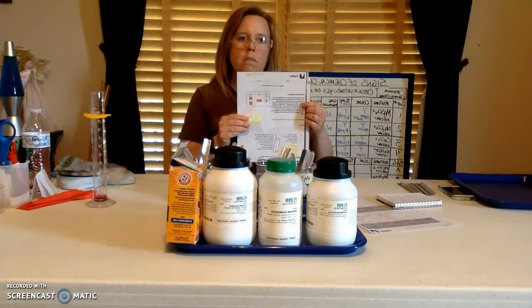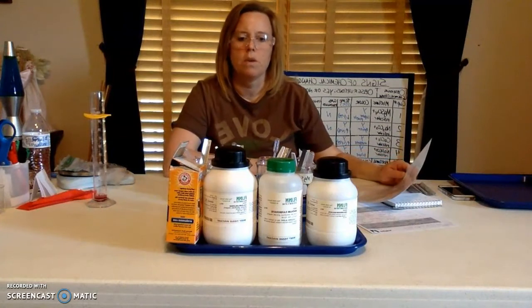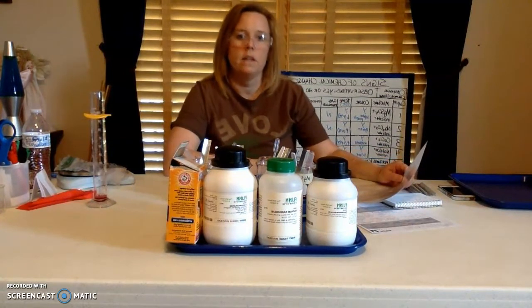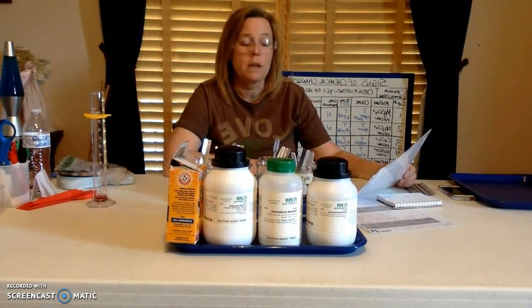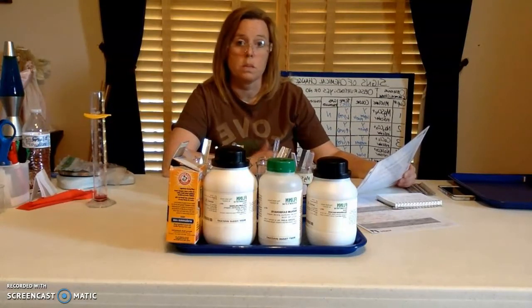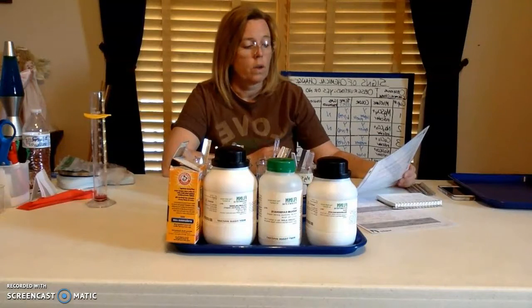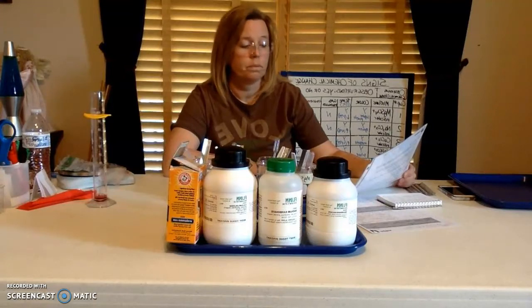So I'm just going to begin by reading the introduction to this, and then I will take you through what we would have done in the classroom. Reactions between substances are happening all the time, both in the laboratory and in our daily lives. Some changes that occur during these interactions are physical, while some are chemical. Some can be quite dramatic, such as explosions, or the creation of totally new substances with strong colors or odors, while others can be quite subtle.